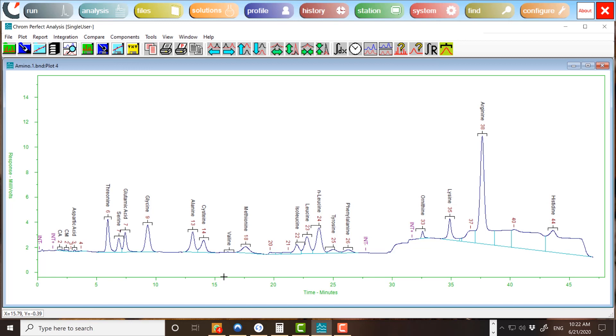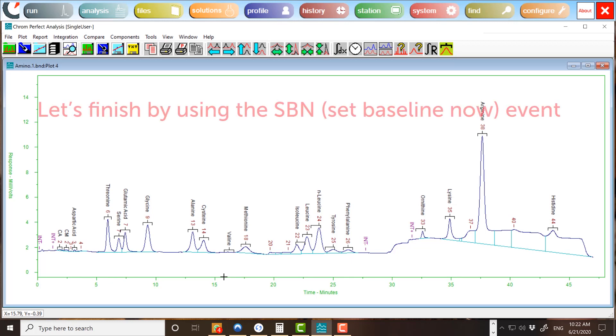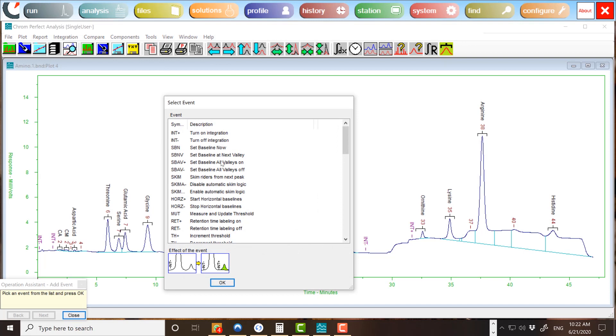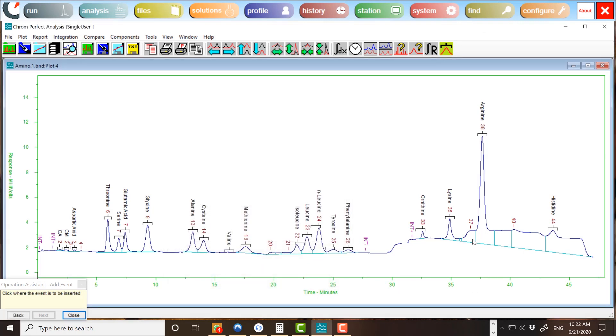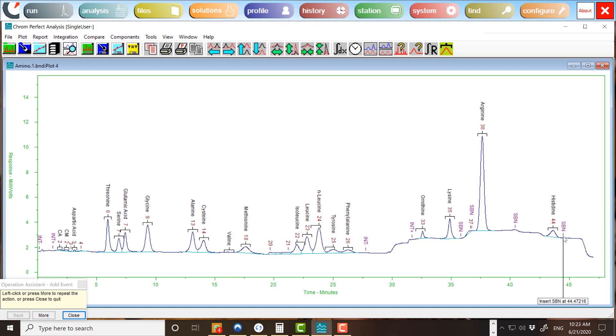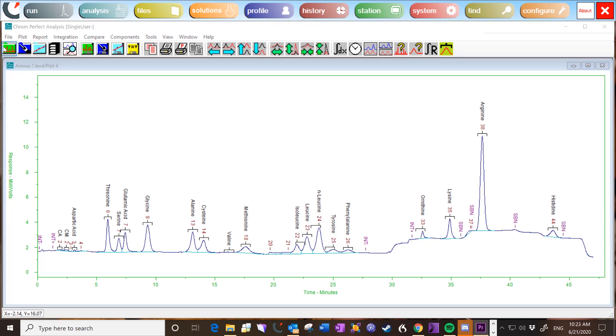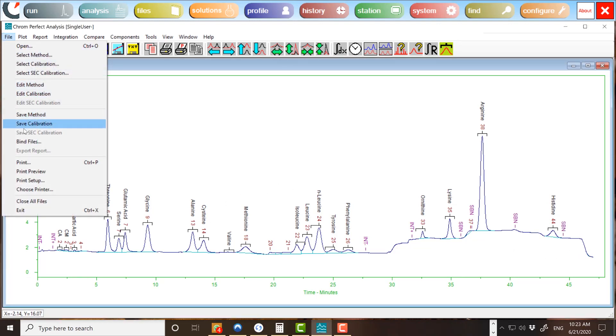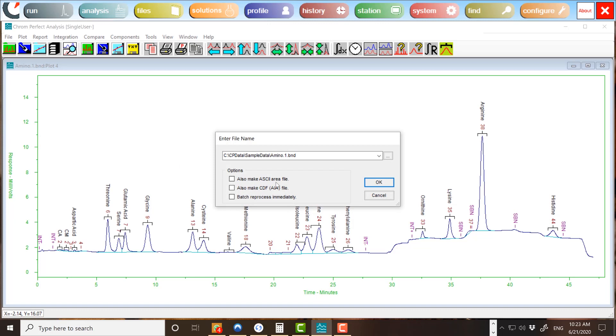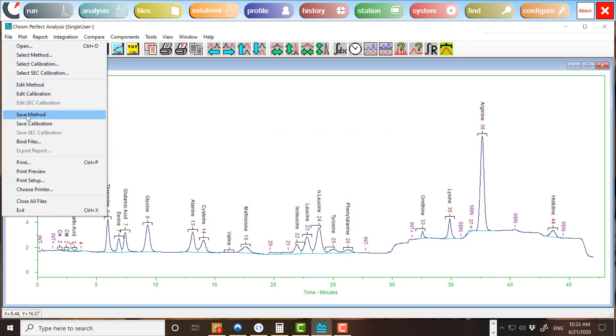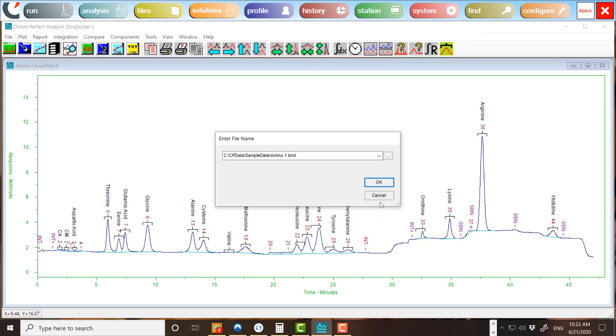Adding, deleting, or moving timed events will destroy any manual integration actions that have been made. Therefore, you should set all timed events before performing manual integration. If you are happy with the resulting integration, you can bind your data file to save the changes. Saving the method will apply the timed events you have added to future analysis that use this method.